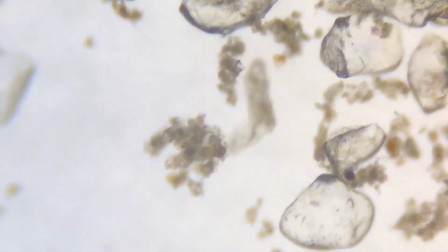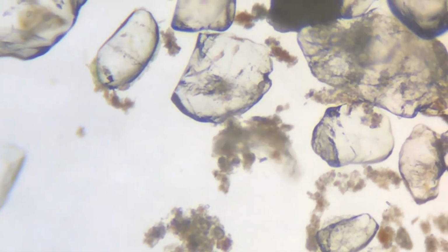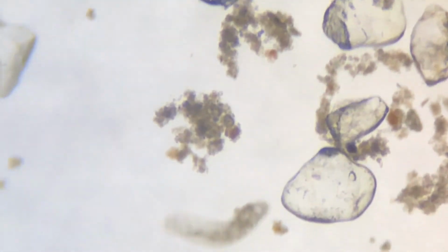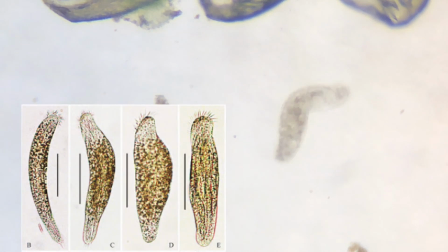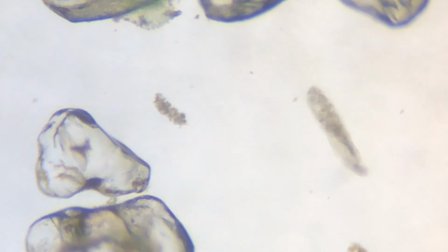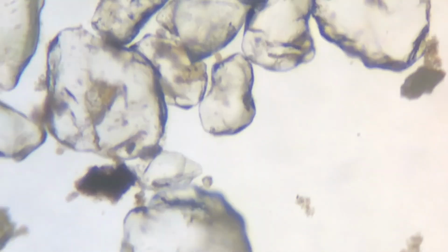I also encountered this microanimal that I mistook for a worm until it was pointed out that this was a ciliate as well. More specifically, a hypotrich ciliate. The organism's body is flexible, which allows it to maneuver through the sand particles and quickly change directions. To me, it looks most like the Uncinata. However, I am unsure of this classification and was unable to examine the cilia of this organism.